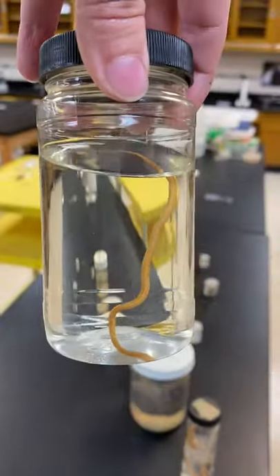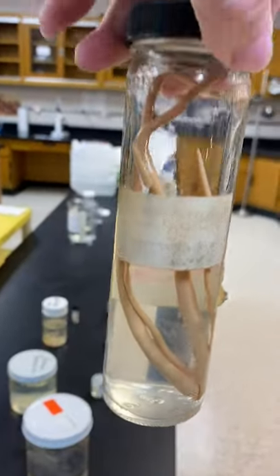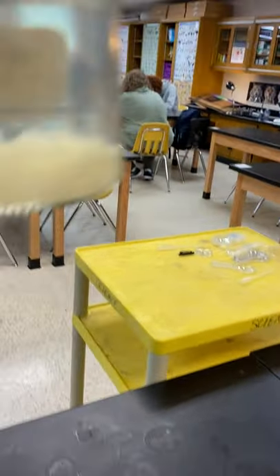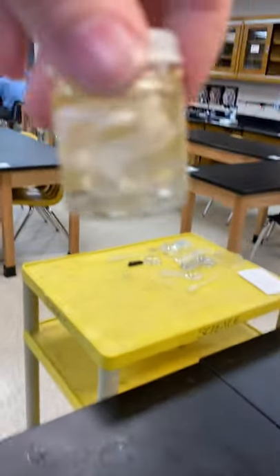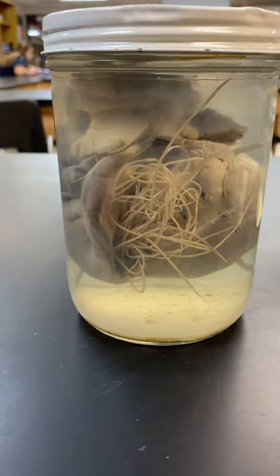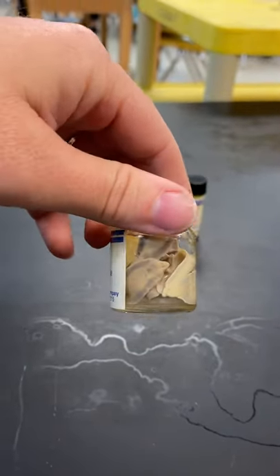Over here you can see what Ascaris looks like — that large intestinal roundworm — but you can only see the cross section since these things are so large. Here are what tapeworms look like: the dog tapeworm, human tapeworm, and cat tapeworm. And here we have dog heartworms. These sheep liver flukes you just saw — the pink one has died.